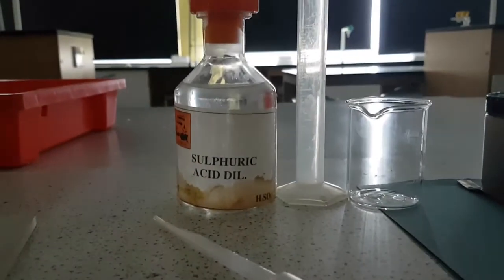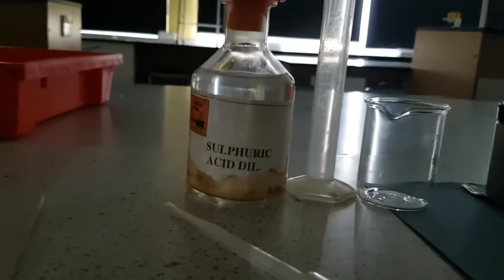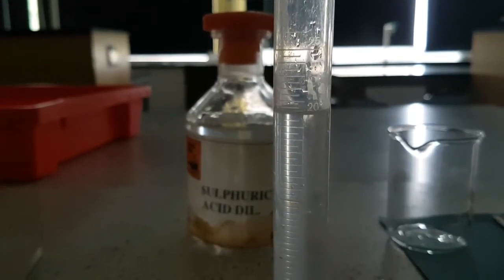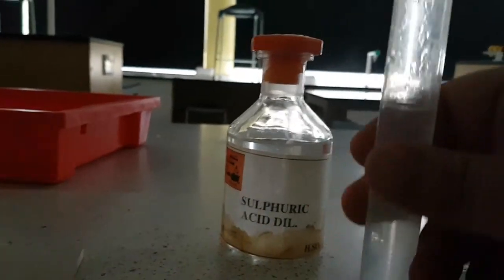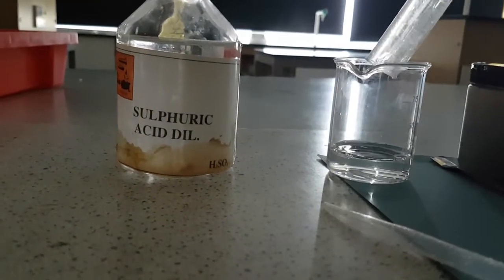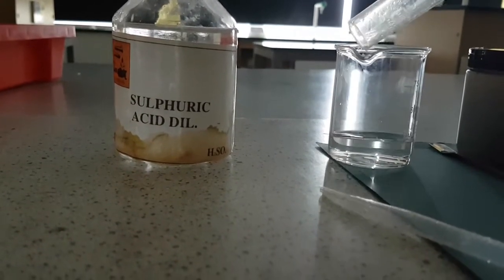I'm going to use the pipette to take out 20 ml of the sulfuric acid and place it in my 25 ml measuring cylinder. I've filled it up to 20 ml, coming down to eye level to avoid any error while filling. I'm going to transfer this into my 100 ml beaker. Make sure you get all of it in.